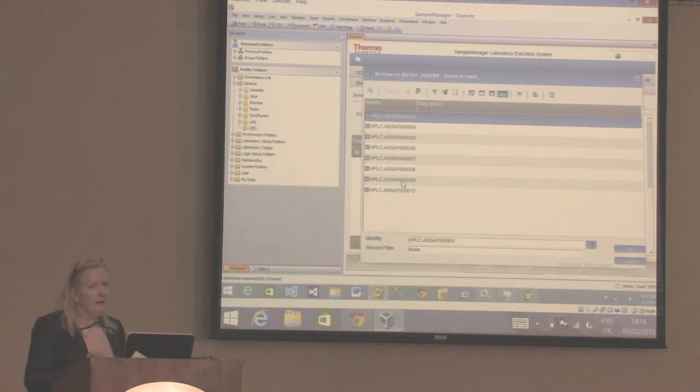So with this method execution, you really should be forcing the analyst to enter the right data at the right time, the right steps, follow the SOP, because by using the method execution and having the steps in such a way, you're making it difficult for them to do something wrong. So it's doing all the checks in the background as well? Yeah, it's doing all of that checking.